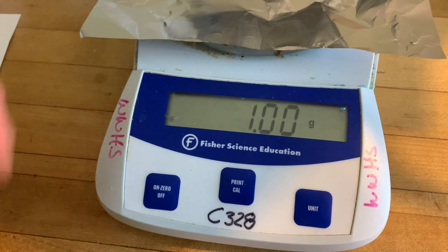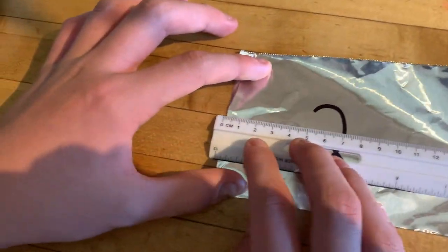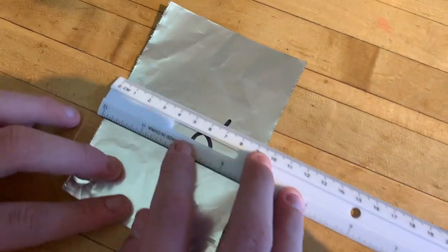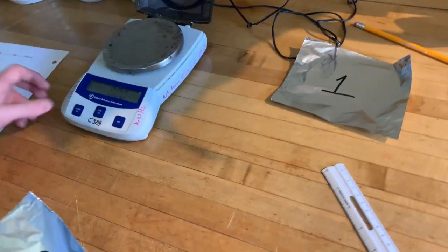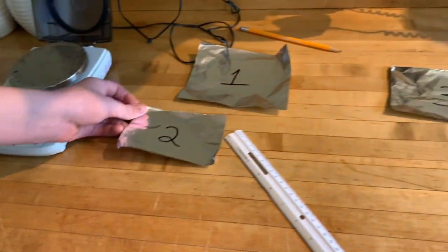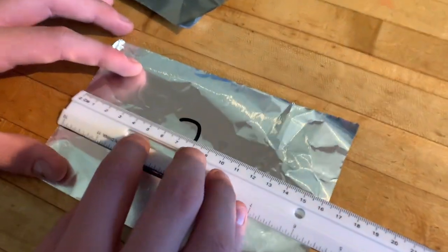For an electronic balance, you write down exactly the numbers shown — there's no need for you to estimate the digit; the balance did it for you. The reading is: one point six five five five.